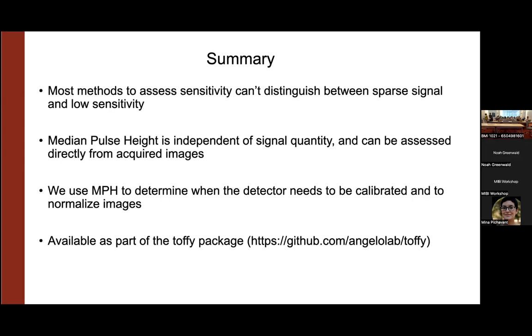If you use the 80% one for 9.5, you will do it more quickly. But in general, it's somewhere between very early on 12 hours up to 36 or 40 hours by the time the detector is very broken.